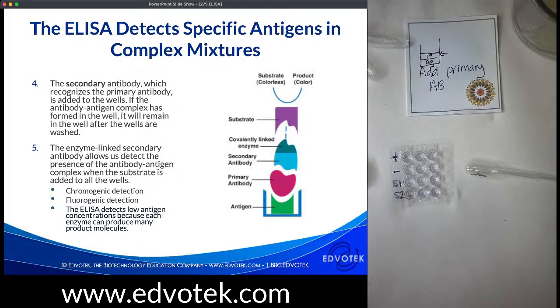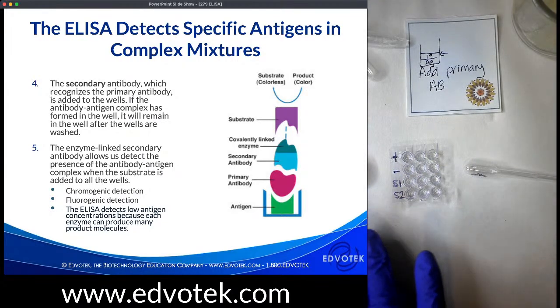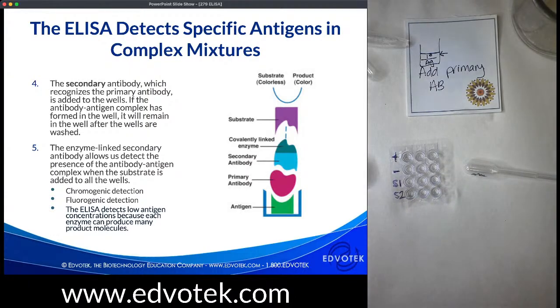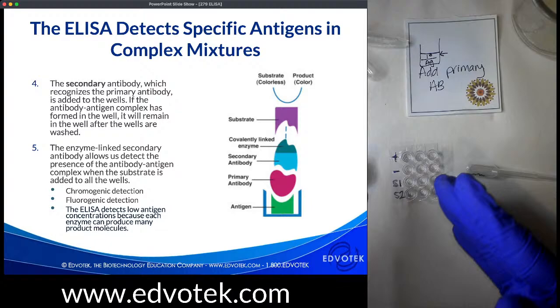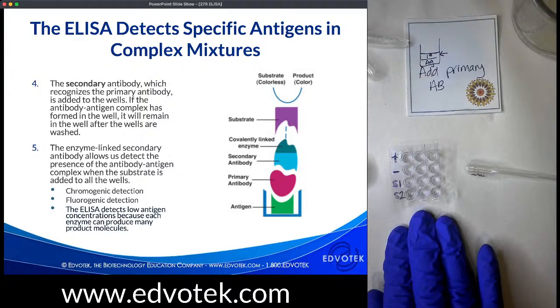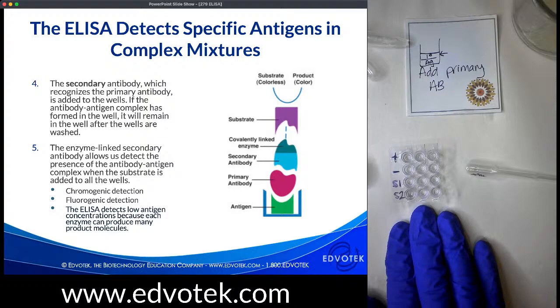Because we're having one antigen, one primary antibody. The primary antibody is recognized by multiple secondary antibodies. Each of those secondary antibodies has an enzyme connected to it, and it's constantly being able to turn over the substrate. And so you can imagine that by building that complex, even if there's only one antigen in here, we have one antigen, maybe we have a dozen secondary antibodies present, and then we're just constantly turning over that substrate because of the enzyme. And so that will allow us to be able to detect even vanishingly low amounts of our antigen in solution. And so if we think about that gluten assay I was talking about, that's looking down to like 3 parts per million, which is vanishingly small.